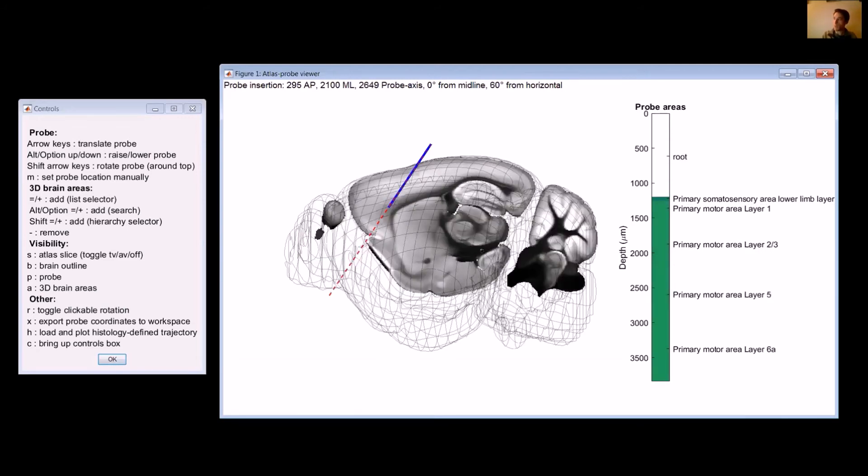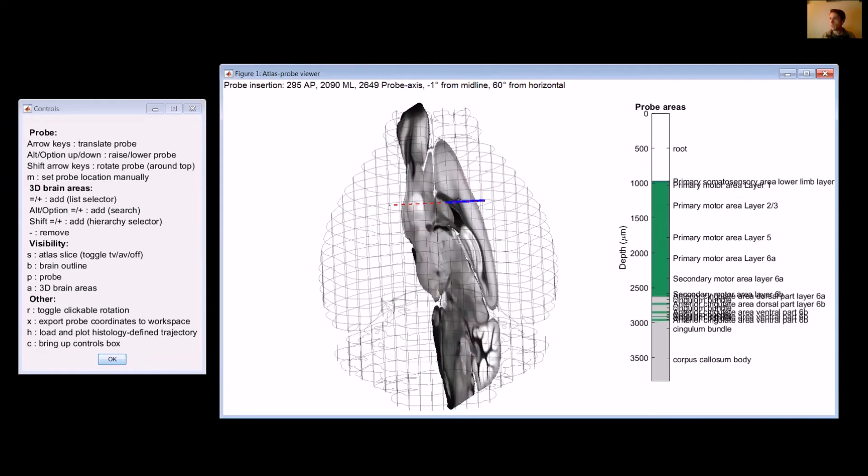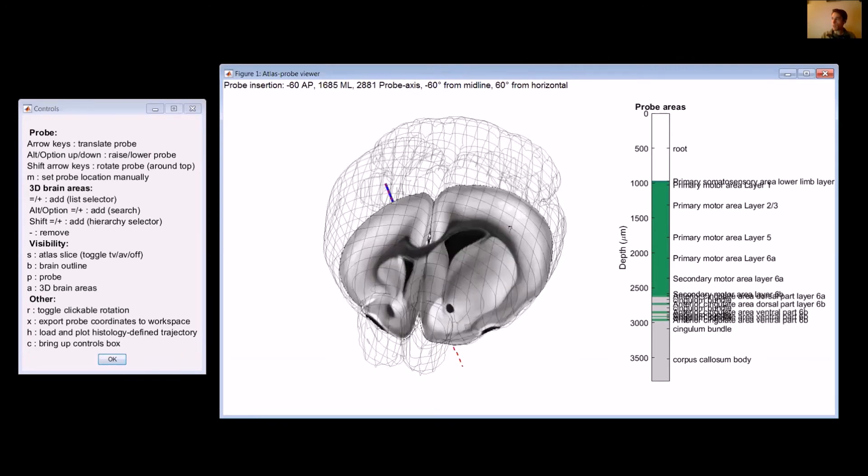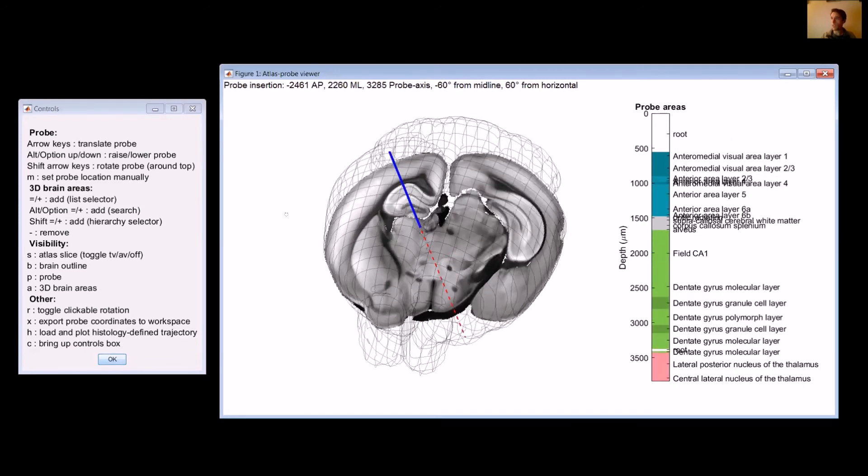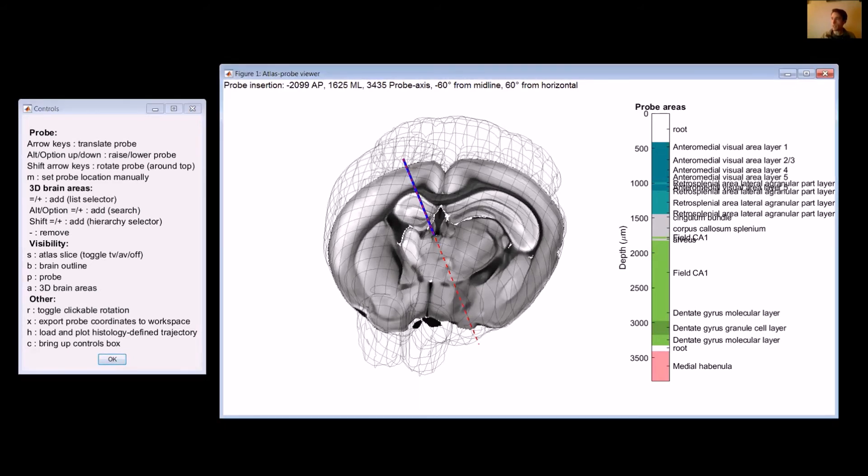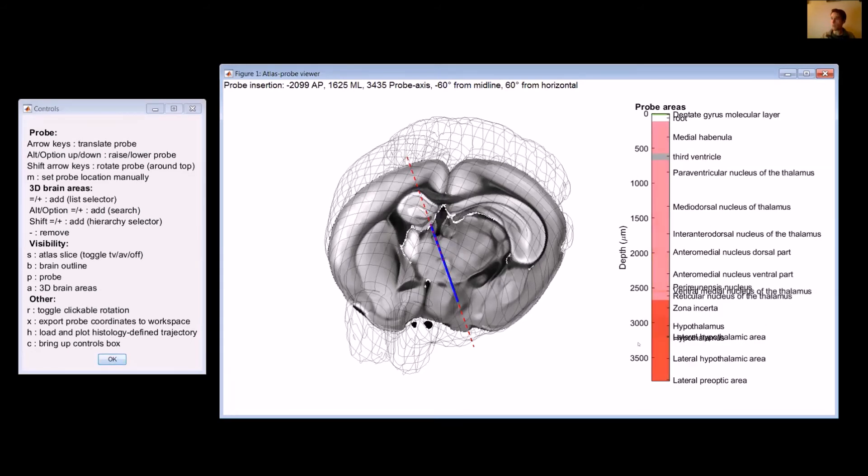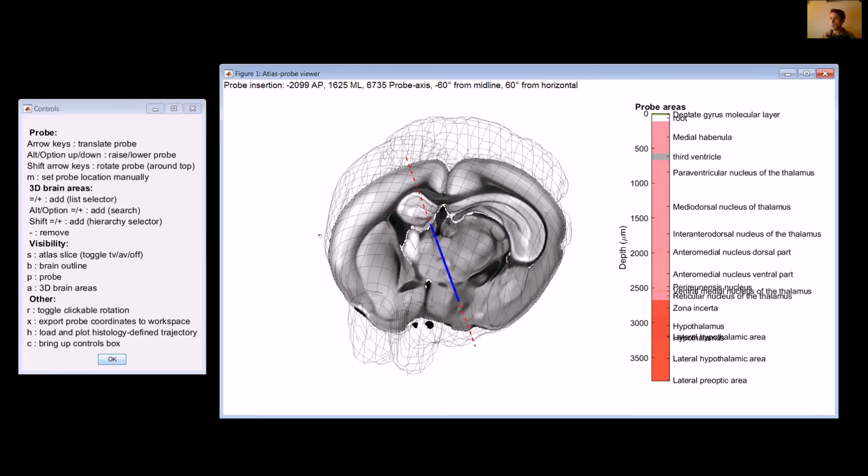All that can be explained very quickly. If you just hold the shift key and you press the arrows, then you can play with this angle. At the moment, if I hold the shift key and I press up and down, you can see I'm wiggling this axis of the probe. So this axis is the one that you'd set your manipulator rotation at. So that's one axis of rotation. The other axis of rotation is where you'd put your manipulator. So now I'm pressing left and right. You can see now I'm coming from the back. And then if I rotate it, now you're coming from the back. So those are the ways that you move the probe around manually. So if you're trying to just see where you can hit your probe, then you can move it around like so. The final thing is that you can change the depth of your probe by holding ALT. So that's shown here. ALT up and down raises and lowers the probe. As I said, the blue is the length of the probe and the red is kind of the rest of the trajectory. So if I hold ALT, you'll see the probe moved down. And now we've got a different set of areas over here that we're going through.